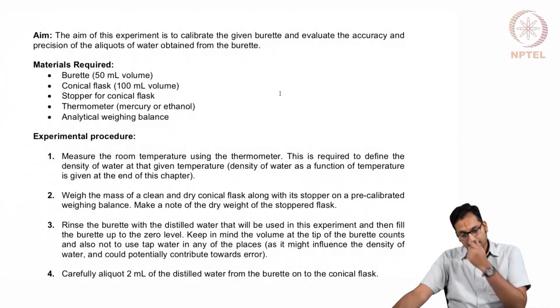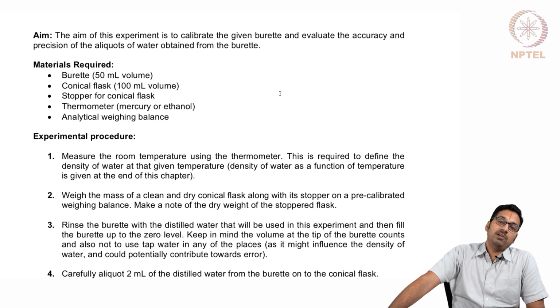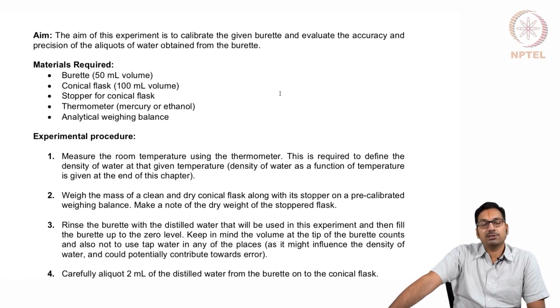So in order to do the same, we will be taking an example like we had done in one of the earlier lectures, where we will be taking an example of how a burette can be calibrated. And as always, we should be also taking a look at the different steps that are required in order to do such an experiment. While doing so, we will also be taking a look at where all systematic errors could come up and how this data can be looked upon to see whether you have systematic errors that has cropped up, in order for you to repeat the experiments if possible.